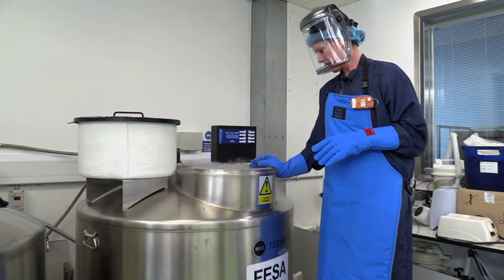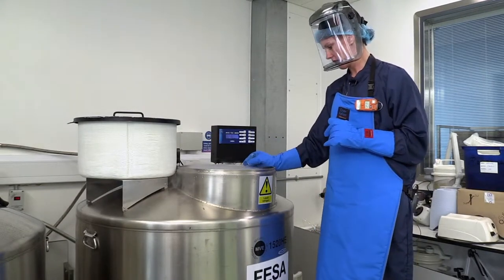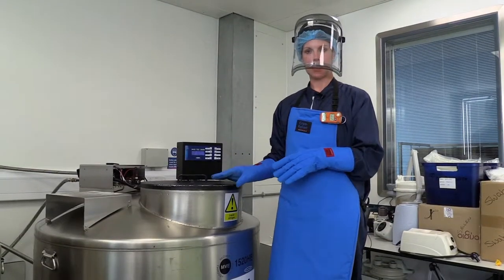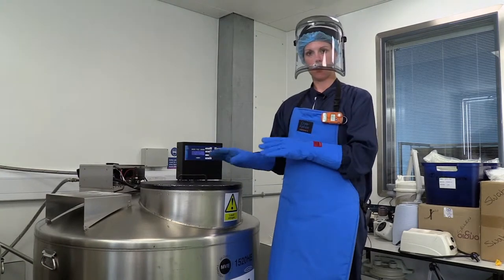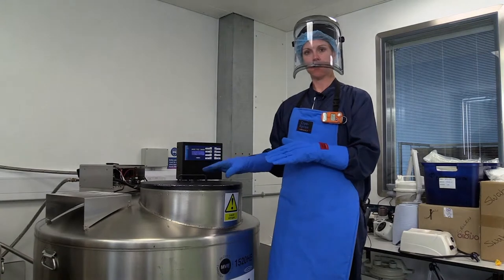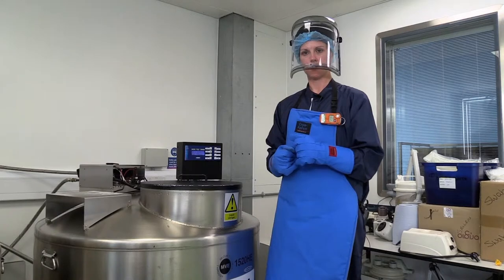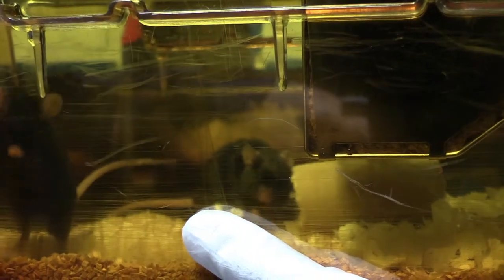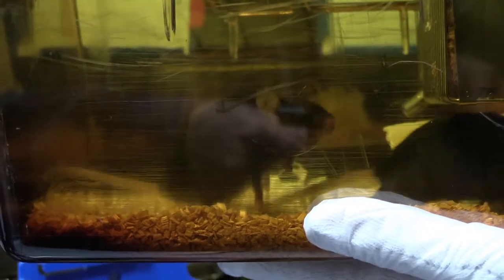In here we've got something like 76 of these racks, so that's a lot of samples. One of the main reasons we freeze these samples down is that all of the mice that have samples in here have lots of different mutations that are all very important for the scientific community. We don't want to be breeding lots of mice that are not required, so we freeze them down if the scientists aren't working on the particular lines anymore.